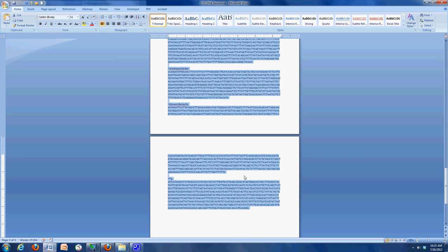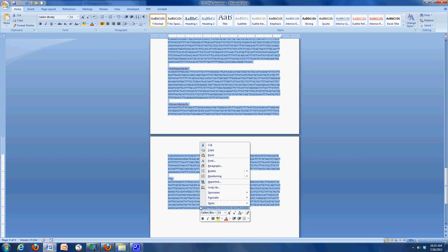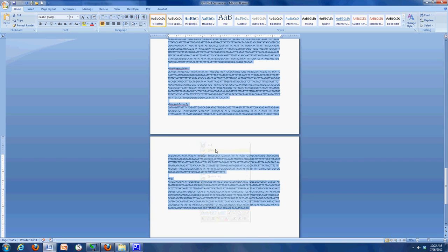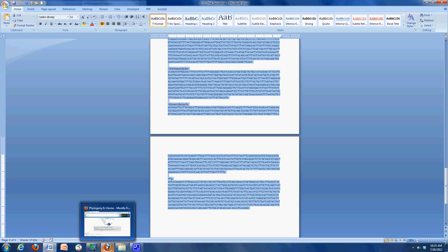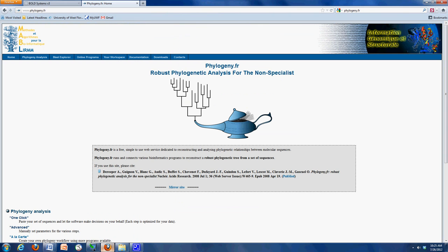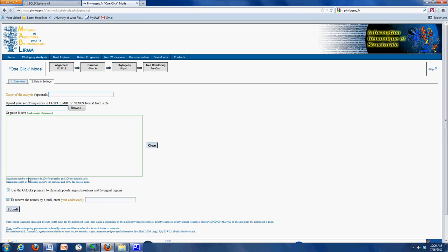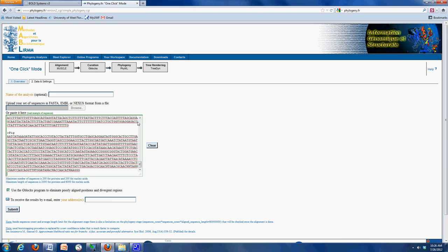I will copy these. I already have the phylogeny FR open. I'll go up here to one click and select. In this window I'm going to paste my sequences, and you should not need any other alterations, so I'll just go down here to submit.